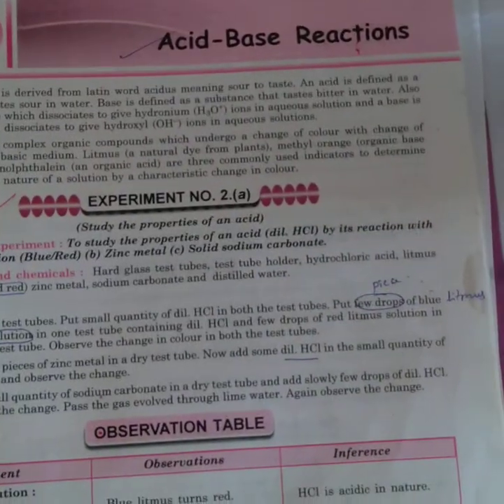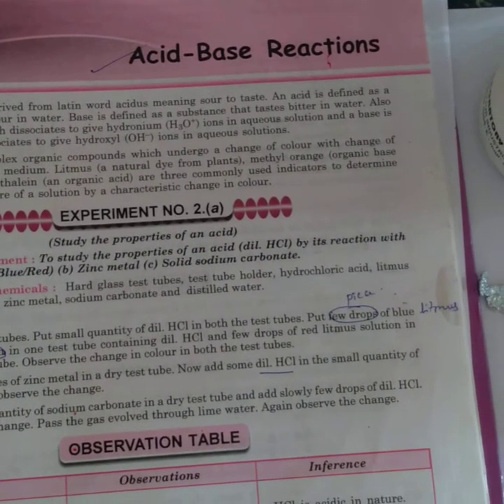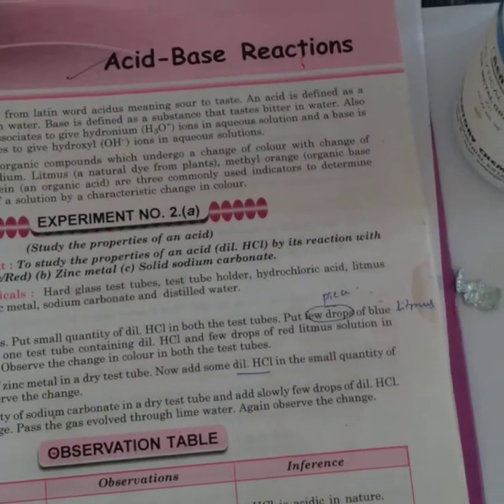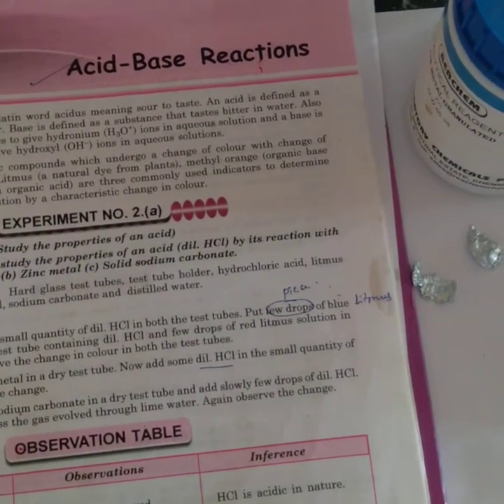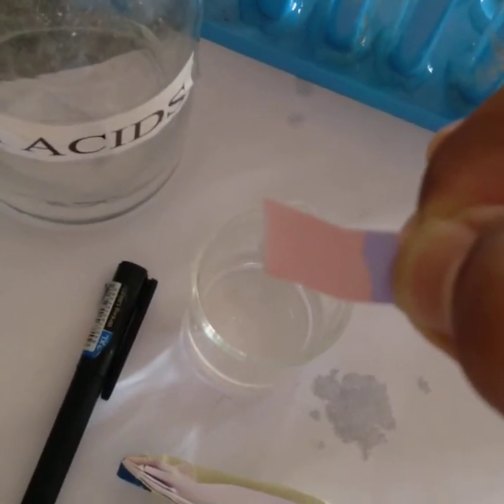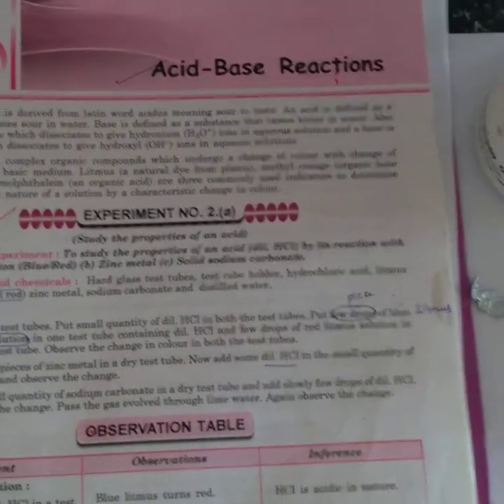So we have taken a blue litmus. Take this blue litmus and dip it in the solution containing acid. You can take it in a test tube or a beaker. Just observe that you can see changes in the blue litmus paper. Blue litmus changes to red. What does it indicate? You already know that if acid is present, blue litmus always changes to red.